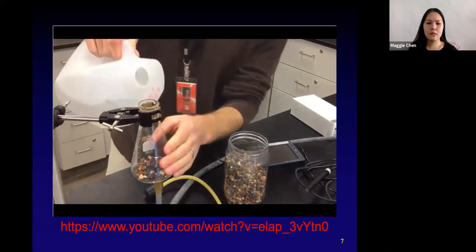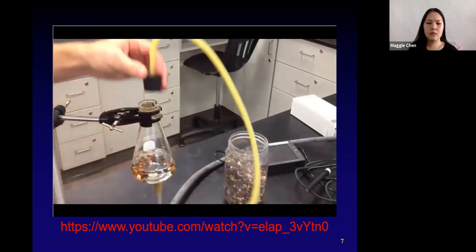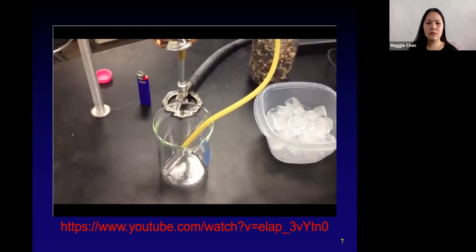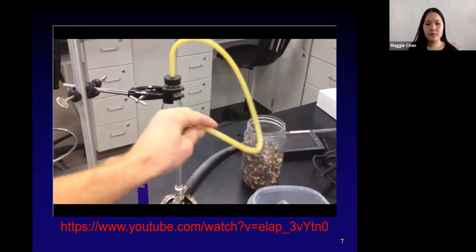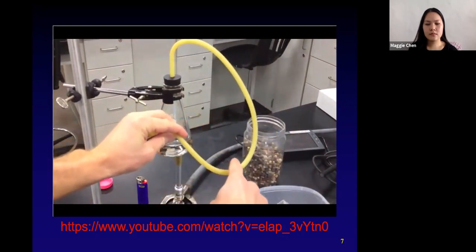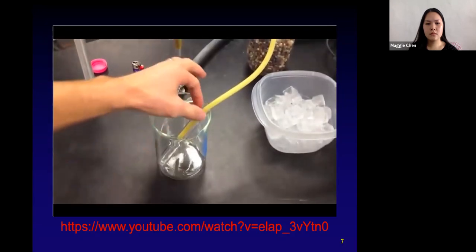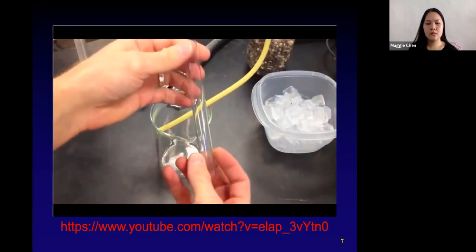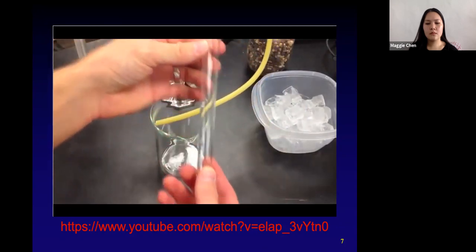Also add 100 mL of salt water to the Erlenmeyer flask. Replace the cap on the flask. Make sure the rubber tube travels continuously downward without a bend or kink where water can build up — that can be dangerous. So make sure it's a normal line going all the way down. The test tube must be extremely clean because you're going to be collecting clean, pure distilled water, so rinse it out thoroughly with distilled water.